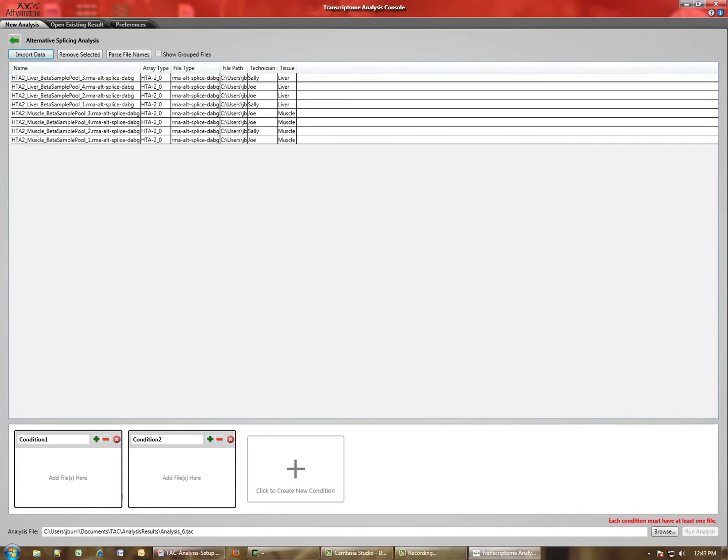Now that your data is loaded here, I want to show you one neat feature that can be useful in trying to assign your individual files to the various groups. And this is the Parse File Names function.